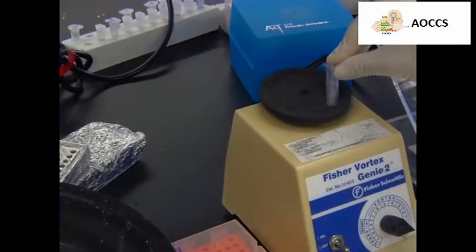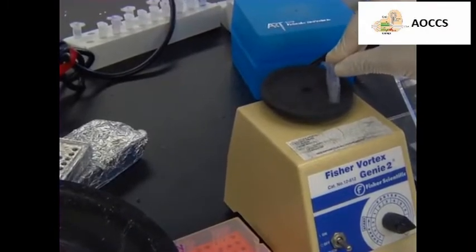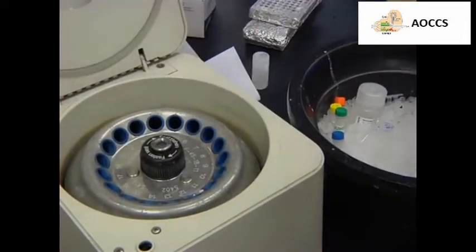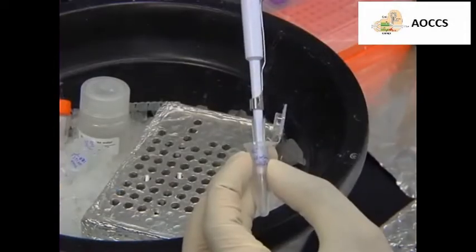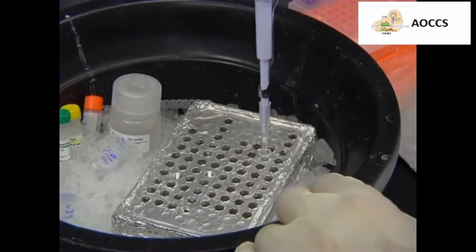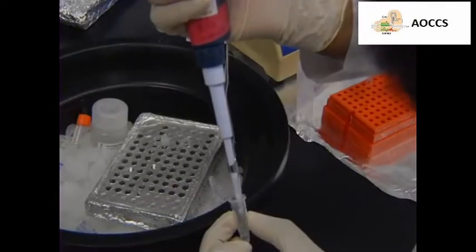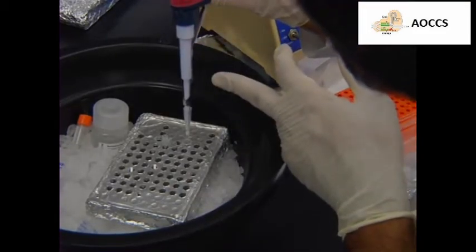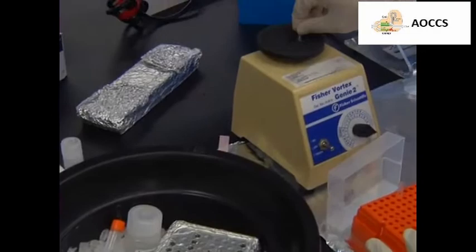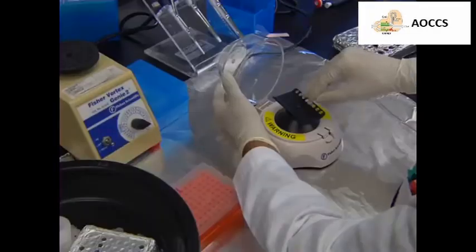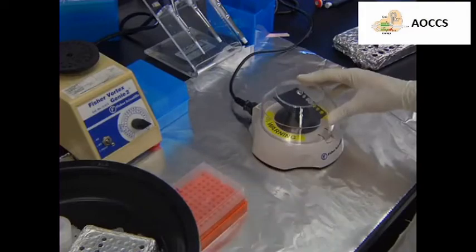Next, mix the working solution by vortexing it for 1-2 seconds at maximum speed. Briefly spin down the solution for 10 seconds, and then dispense the working solution into nuclease-free PCR tubes. Then, add the template RNA directly into the PCR tubes. Gently vortex the reaction for 1-2 seconds to ensure that all of the reagents are thoroughly mixed, and spin down the tubes for 10 seconds.